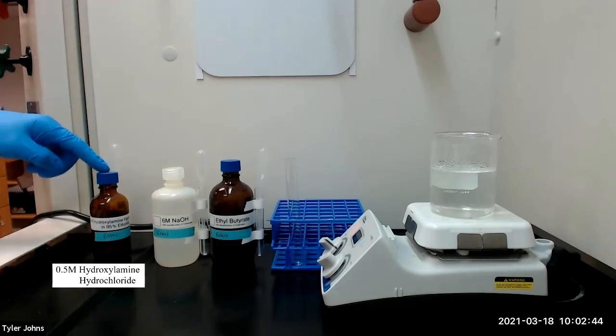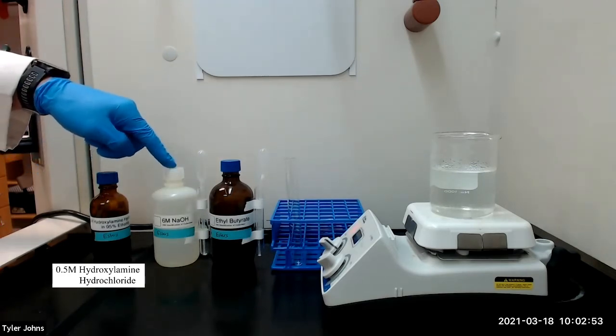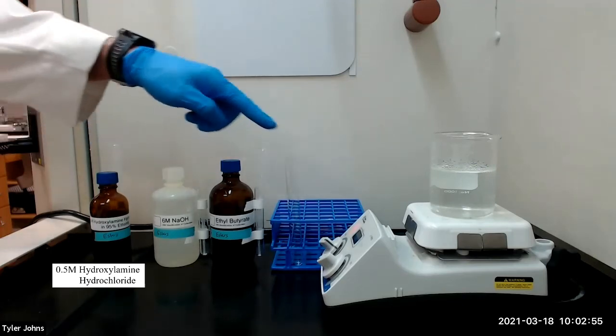We will begin by adding one milliliter of 0.5 molar hydroxylamine hydrochloride dissolved in 95% ethanol and 0.4 milliliters of 6 molar sodium hydroxide to a test tube.